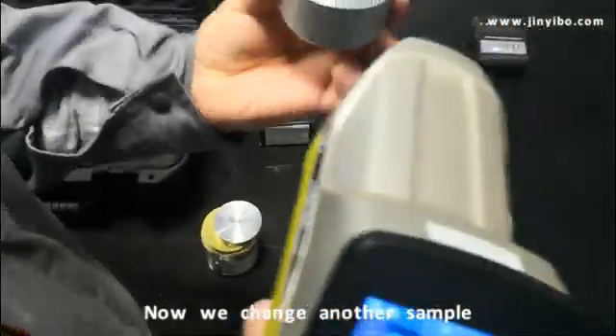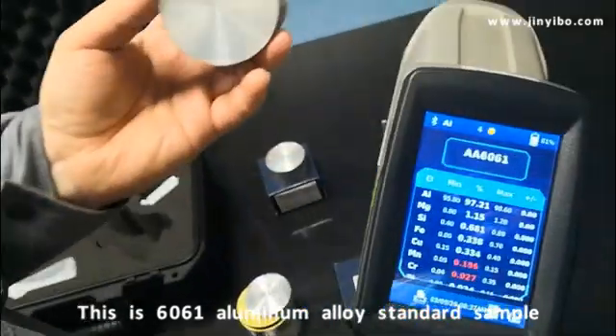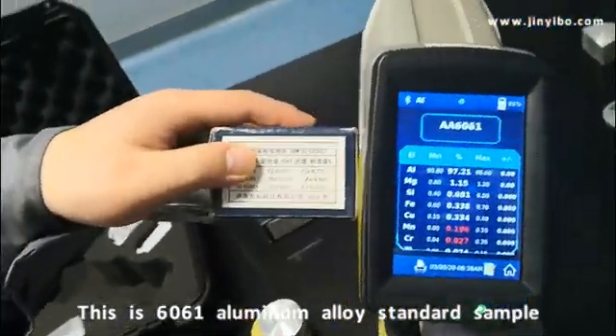Now we change to another sample. This shows you 6061. Now we confirm 6061.